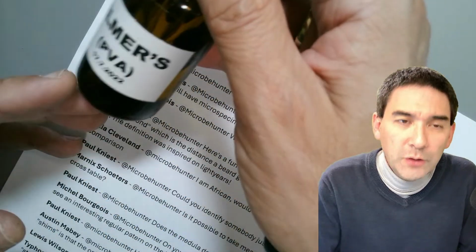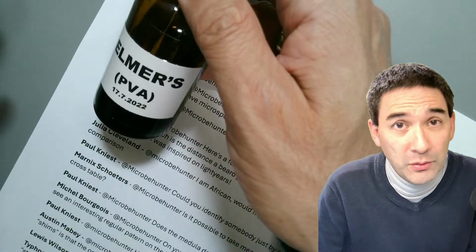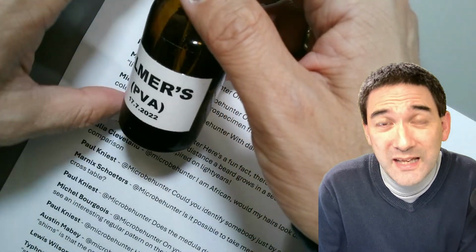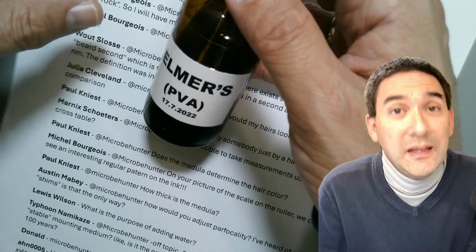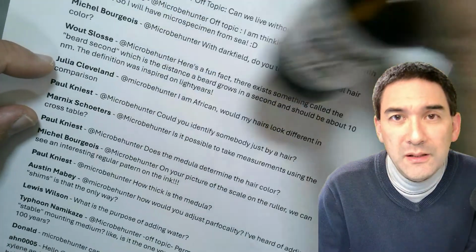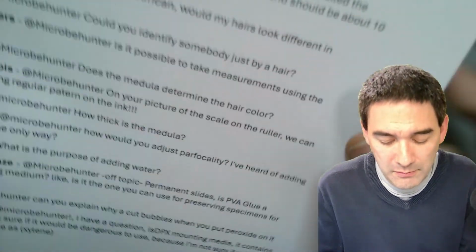It's good for hobby purposes. I've had good results with this for a couple of years. Whether it actually makes this slide stable for 100 years, I don't know. If you really want to make slides on a serious scale, then I would probably use mounting media that are established, if I may say it like that.